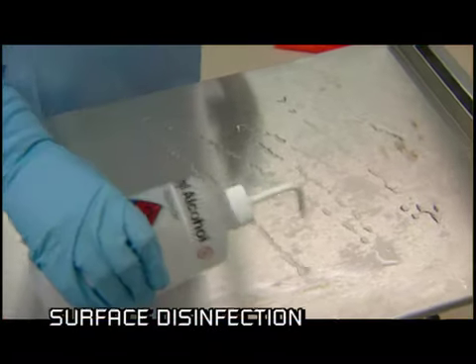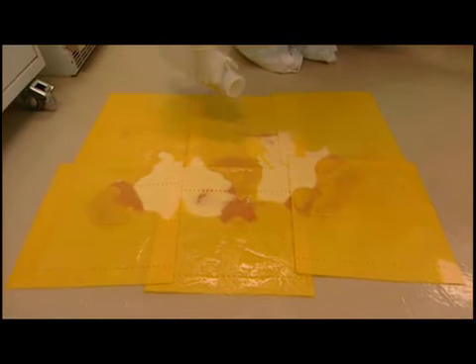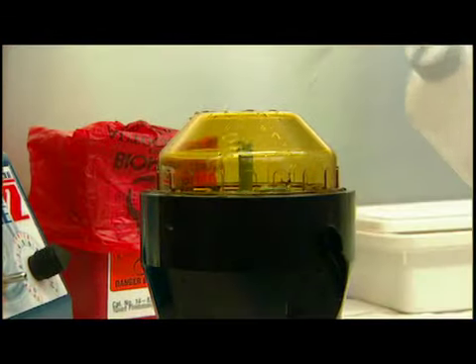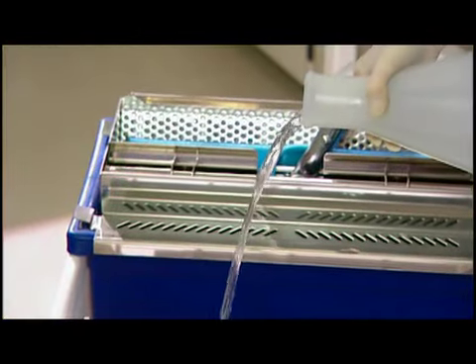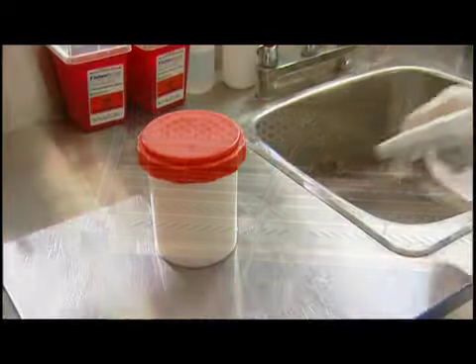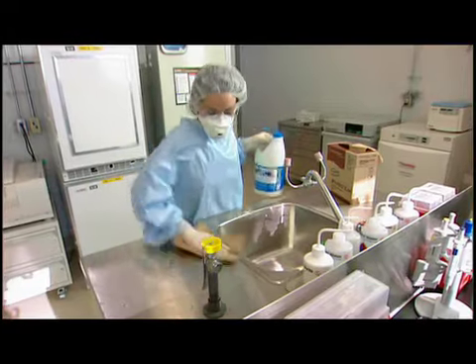Chemical disinfectants are used on surfaces and equipment that cannot be autoclaved, as well as for cleaning up spills. Choosing the proper disinfectant depends on the microbial agent you're working with and on the disinfectant's practicability, stability, compatibility with materials, and potential health hazards.